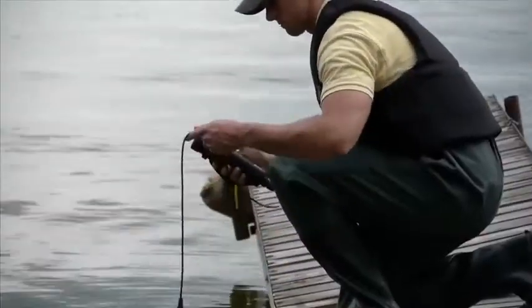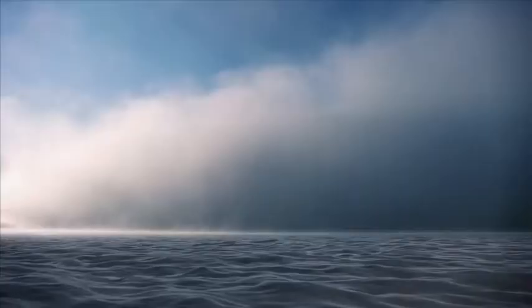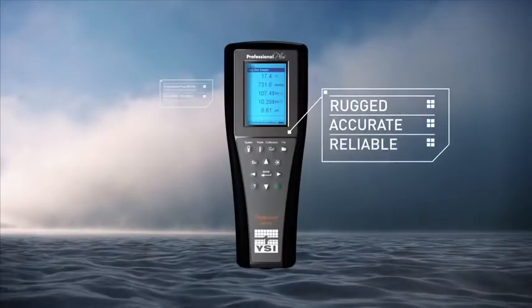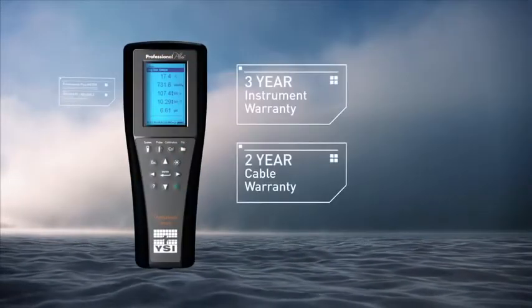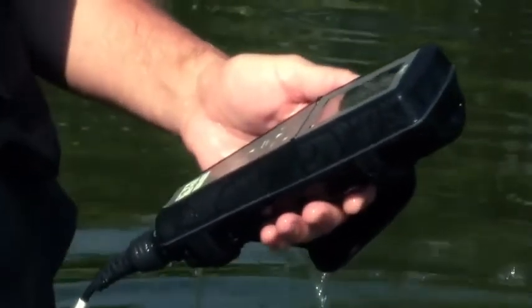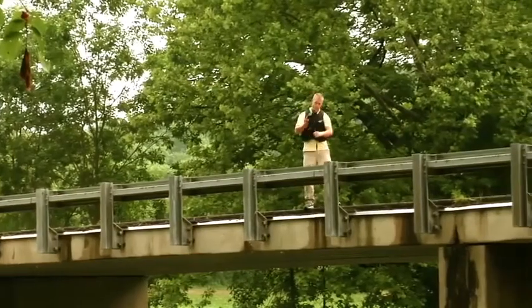The YSI ProPlus has all the built-in support you'll need for the lab or field. All YSI products are rugged, accurate, and reliable. All Pro Series instruments include a 3-year instrument warranty, 2-year cable warranty, IP67 waterproof rating, rugged military spec connectors on all meters, 1-meter drop test rating, and a rubber over-molded case.